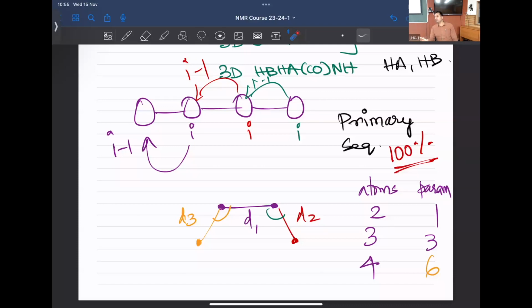What do we mean by this? If I can take the entire classroom right now, if I can define the distance between each student to each other student, then can I virtually recreate how the students were sitting in my class? So I don't take a picture. NMR is not taking a picture of how the students are sitting. I just ask student 1 to 2, what is the distance between them? I assume student 2 to 1 is also the same distance. Then I ask student 1, what's the distance between you and student 3, 1 and 3?